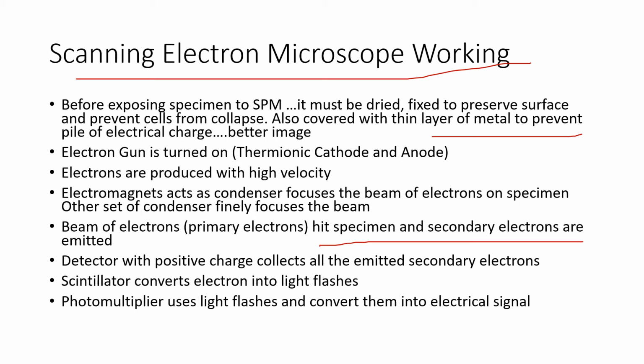Don't worry. Finally, we have detectors called secondary electron detectors, which have a positive terminal over the point. Like if we have a secondary electron detector over here, it'll have a positive terminal over here because our electrons are of negative charge, and we need to ensure that all the secondary electrons coming out of the specimen get collected by the secondary electron detector.